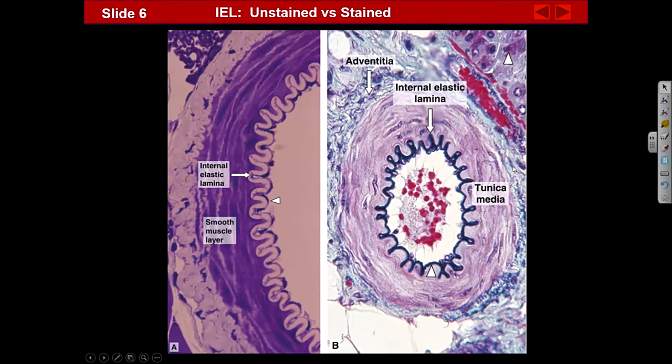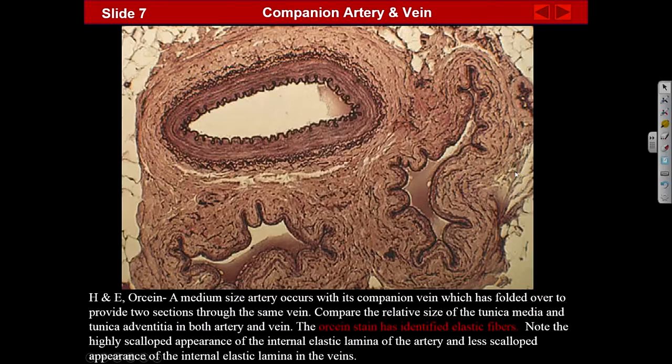Okay. And here's again two blood vessels, artery and vein, companion, right? Again, I think now you can kind of get the idea of the artery has the more open lumen, usually a more prominent internal elastic lamina. Media, we can pick out quite clearly. Whereas the vein, okay, we don't really see a media. It might be one or two cells of smooth muscle there. That's about it, because the adventitia is the thickest layer of veins. The lumen is collapsed. Okay, here's this same blood vessel probably looped over like this. Okay, any questions here? So we'll always look for the companion blood vessels.